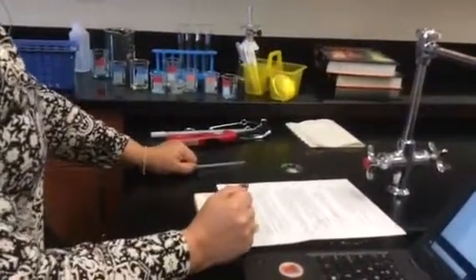Okay, so the zinc is there, and then you're going to find the one that says copper sulfate, CuSO4. Oh, there you are. All right, so then you're going to fill up a pipette, put it in here, and you're just going to let it go for the rest of the time that you're in lab, and you can look at it afterwards, because it might take a while.